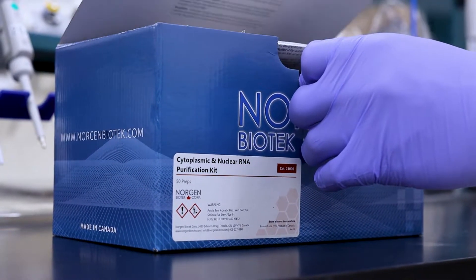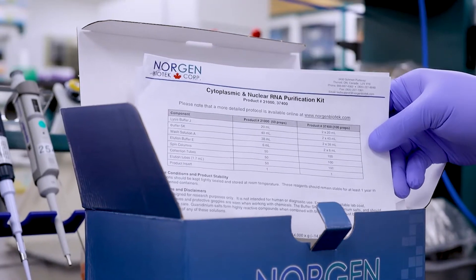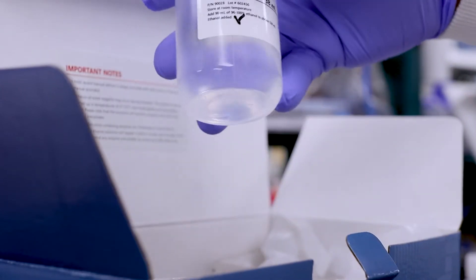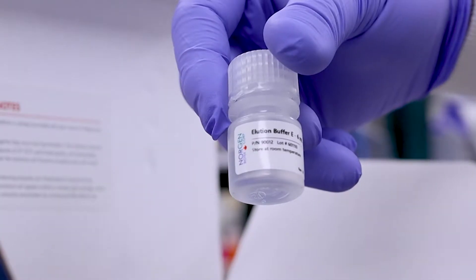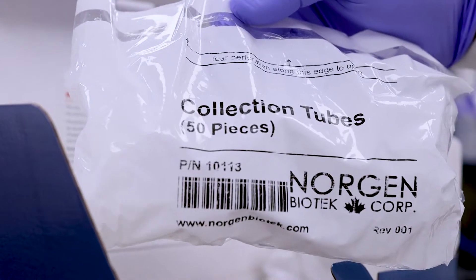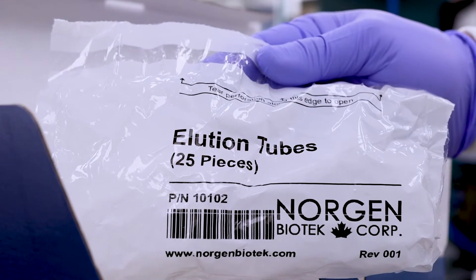Your kit includes a detailed product insert, Lysis Buffer J, Buffer SK, Wash Solution A, Elution Buffer E, Spin Columns, Collection Tubes, and 1.7ml Elution Tubes.